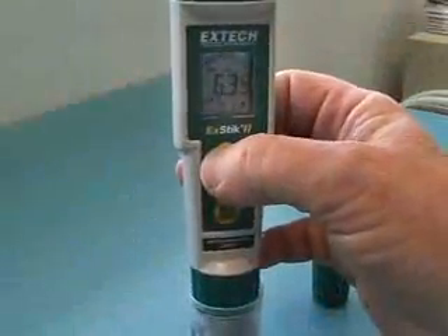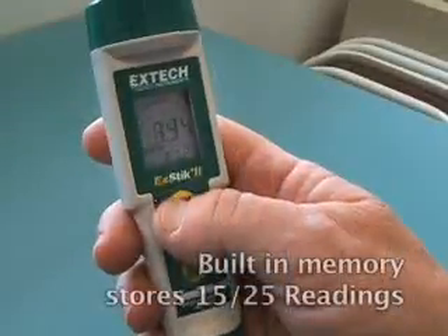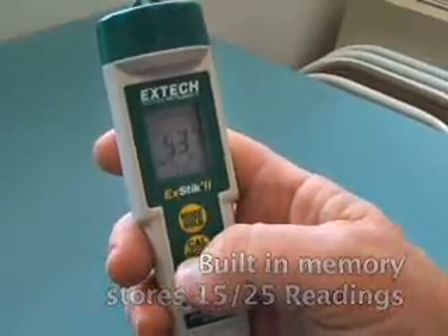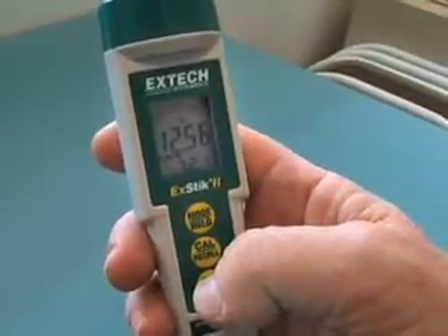The internal memory allows for data recording of up to 15 or 25 readings that are labeled sequentially for easy recall. This feature eliminates the need to bring samples back to the lab — it not only saves time, but provides maximum accuracy for on-the-spot data recording.